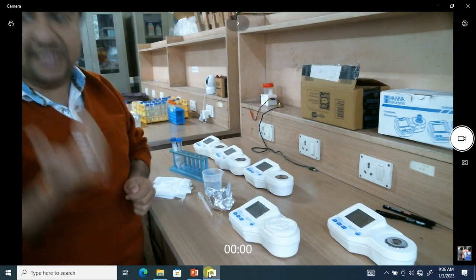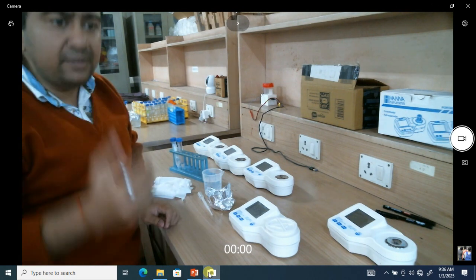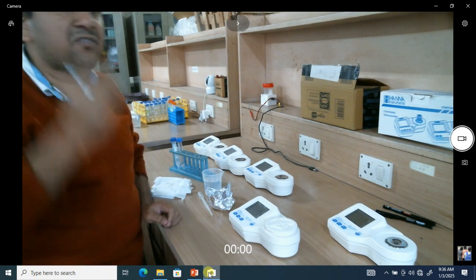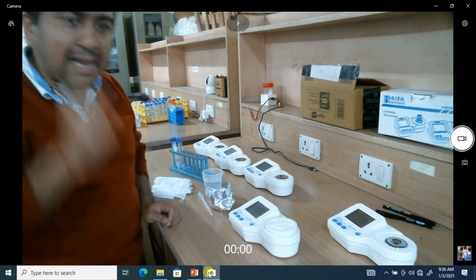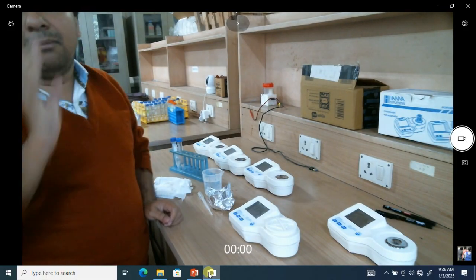Remember this: every time we need to measure the refractive index of any solution, we have to calibrate first with distilled water. Only then will we be able to measure the solution. Otherwise, the reading will interfere.